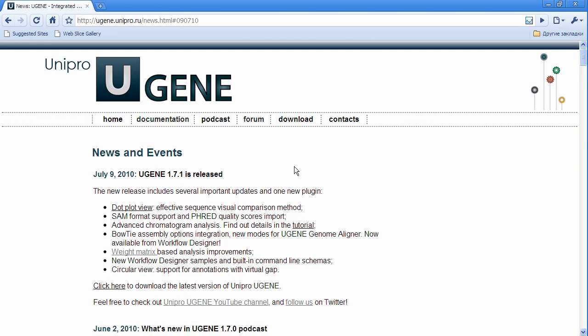Welcome to our What's New in UGENE video. Today, UGENE version 1.7.1 is out, and in this video we will discuss the new features of UGENE 1.7.1.